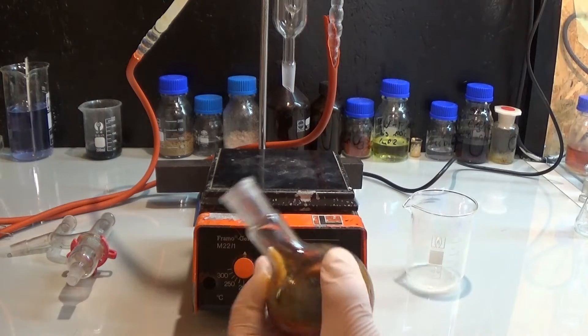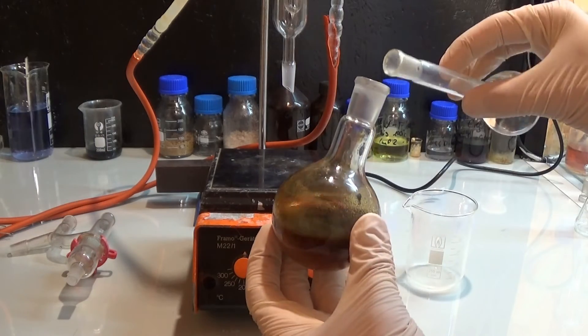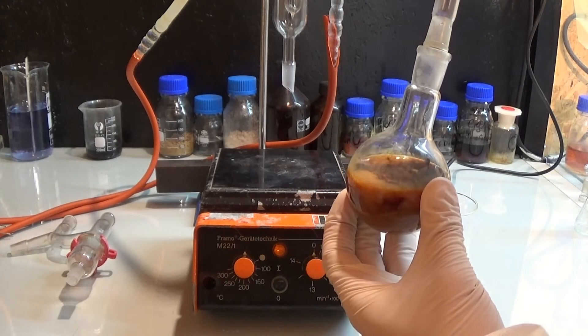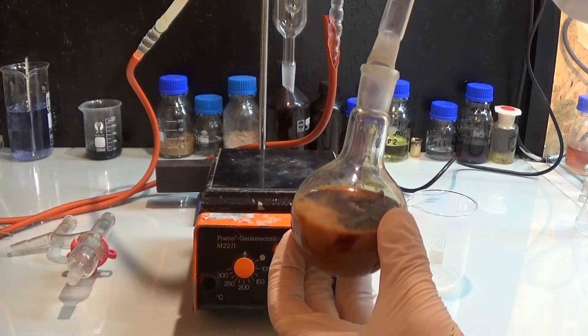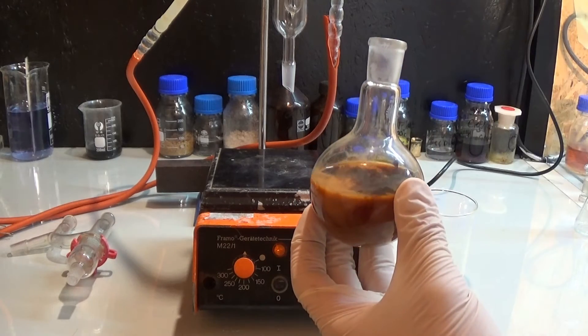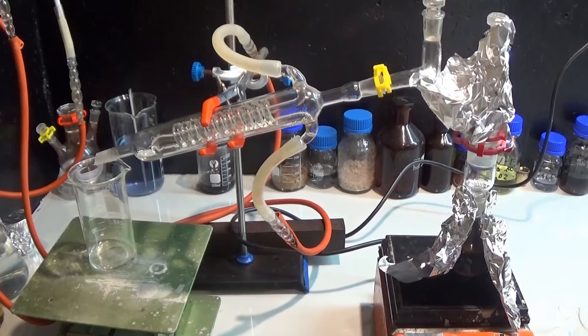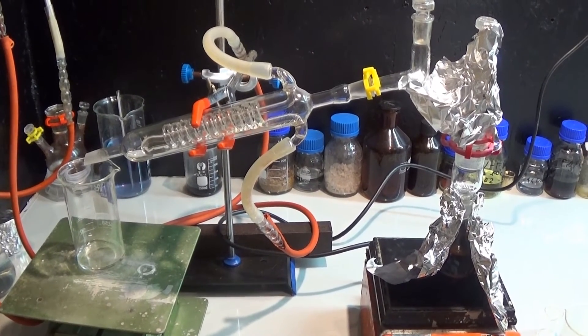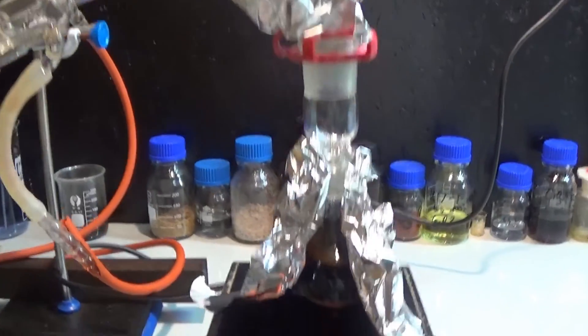The reaction mixture is then diluted with some water and again set up for distillation. This time I even have the footage so you get to see it. The distillation is continued until all of the organic solvents are gone and there is only water and crude potassium cinnamate left in the flask.